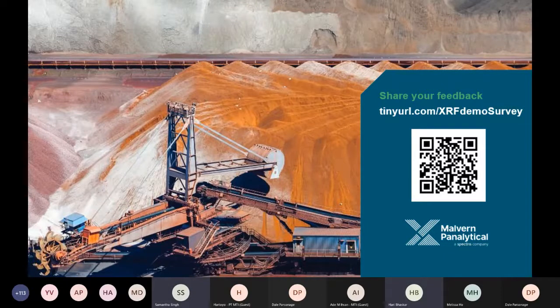Okay, great. And does Malvern Panalytical provide certificate analysis for our samples? Yes, we can definitely provide certificate analysis. So in one of my slides, or even earlier, I think Mel was mentioning, if you remember, we do have our certifying lab in Nottingham in UK, and they will be able to analyze customer samples and provide certificate analysis.